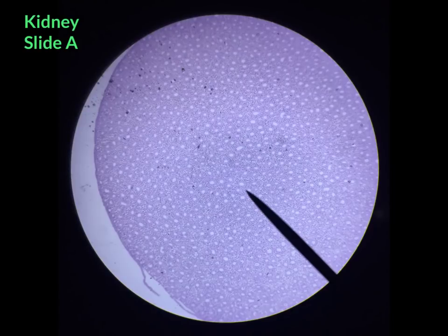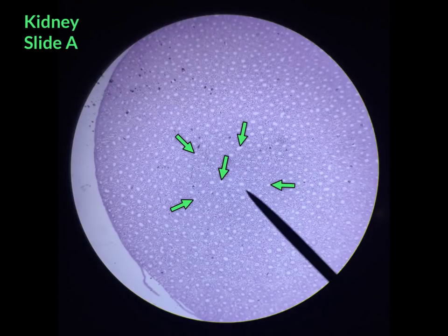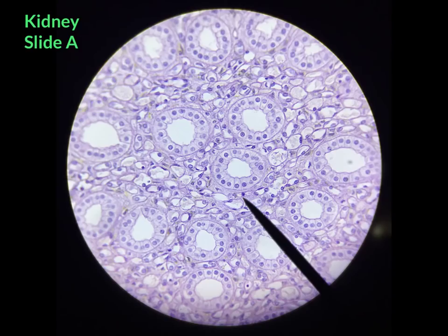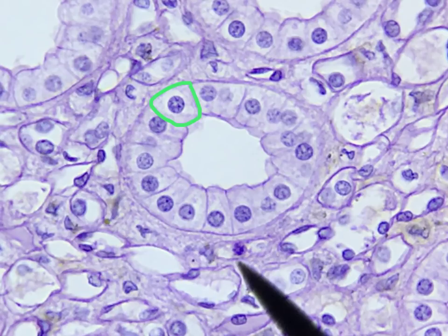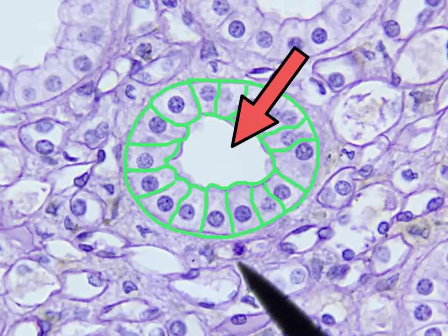The next epithelial tissue is simple cuboidal epithelial tissue, which can be found in the kidney tubules from slide A. When looking at slide A, you want to focus on the tiny little white circles, which are the lumen, or passageways, of the kidney tubules. Looking at the kidney tubules under high power, you can see the simple cuboidal cells. Together, these cells form the lumen, or passageway.